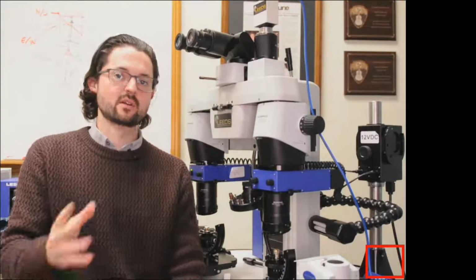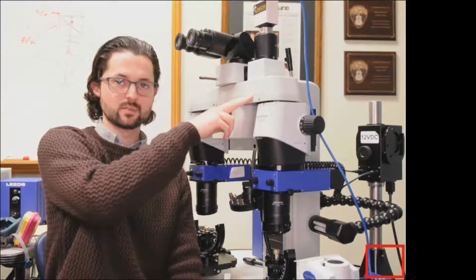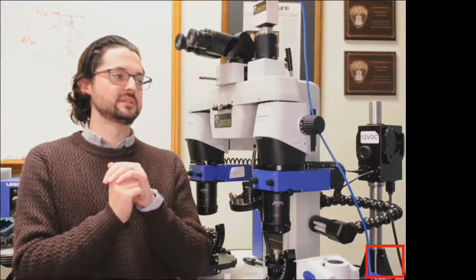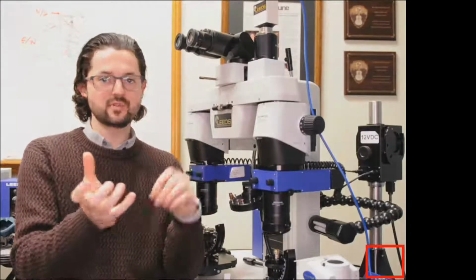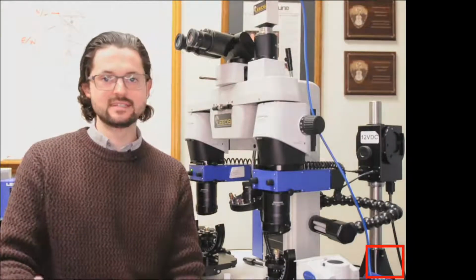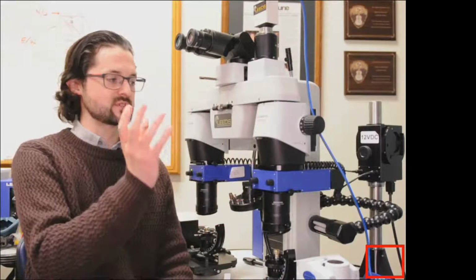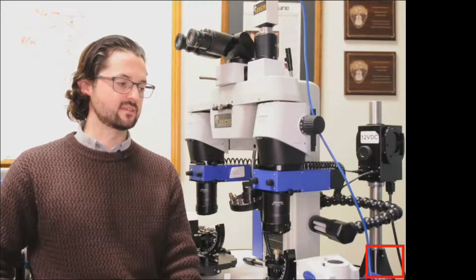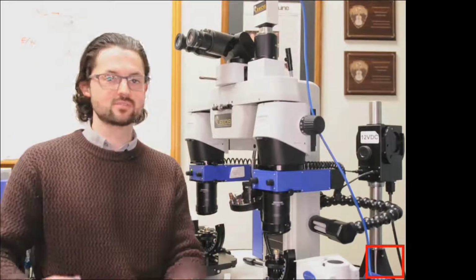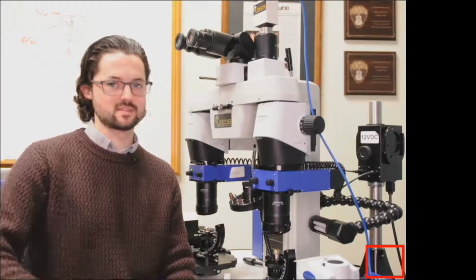The problem, though, is that on our comparison scope, if we were to add a coaxial illumination system between the zoom body and the bridge, it will increase the height of the system. Additionally, it makes it very difficult to remove entirely from the system. And while coaxial is very useful for lighting, it isn't always used. One of the fundamentals of coax is that even when you're not using it, it basically steals about 50% of your light. So we do want to be able to remove it when it's not in use.